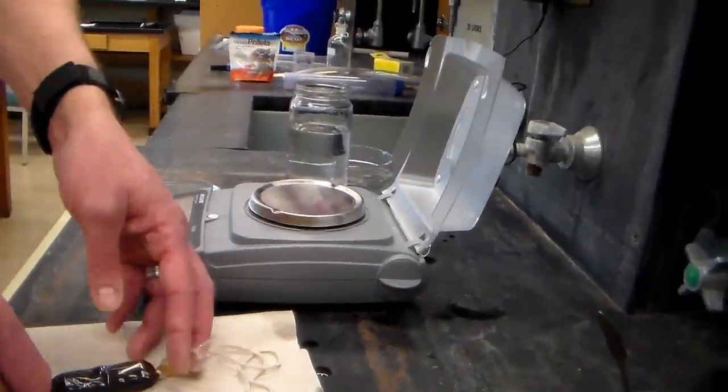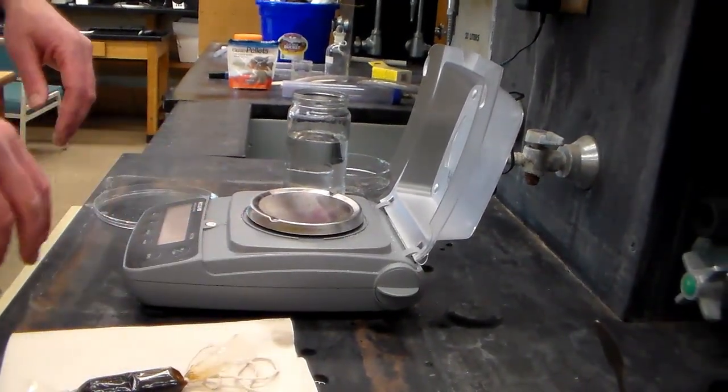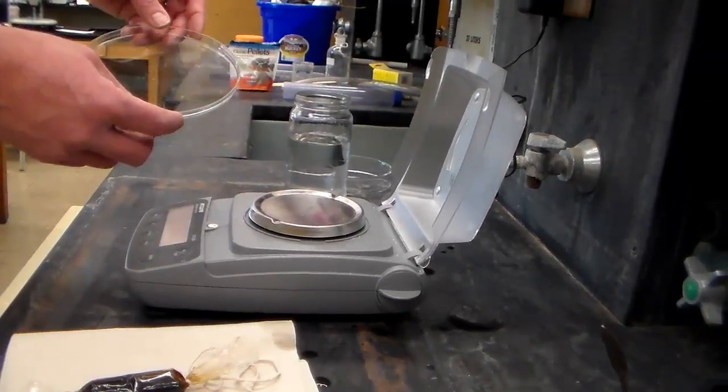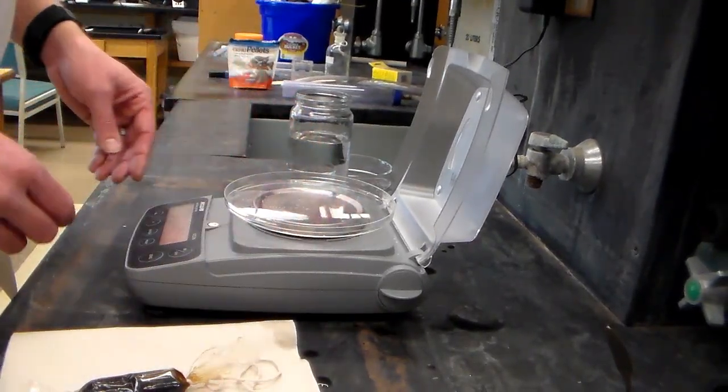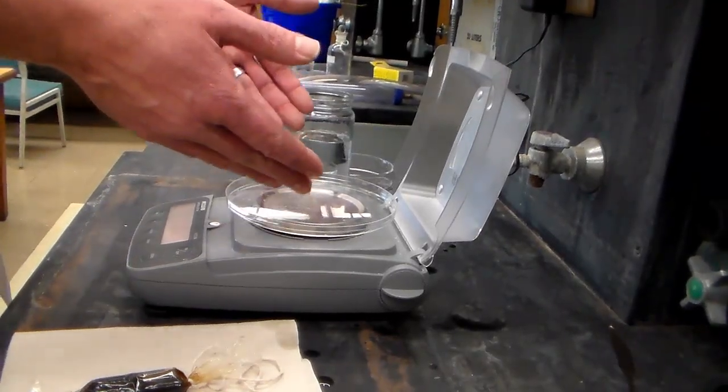Okay, now that we have sealed both ends of our dialysis tube we need to weigh it. Of course, turn the balance on. We want to have some kind of a tray to set the dialysis tubing in. This is a top of a petri dish. So we'll set that on there, but of course we don't want to include the weight of the tray.